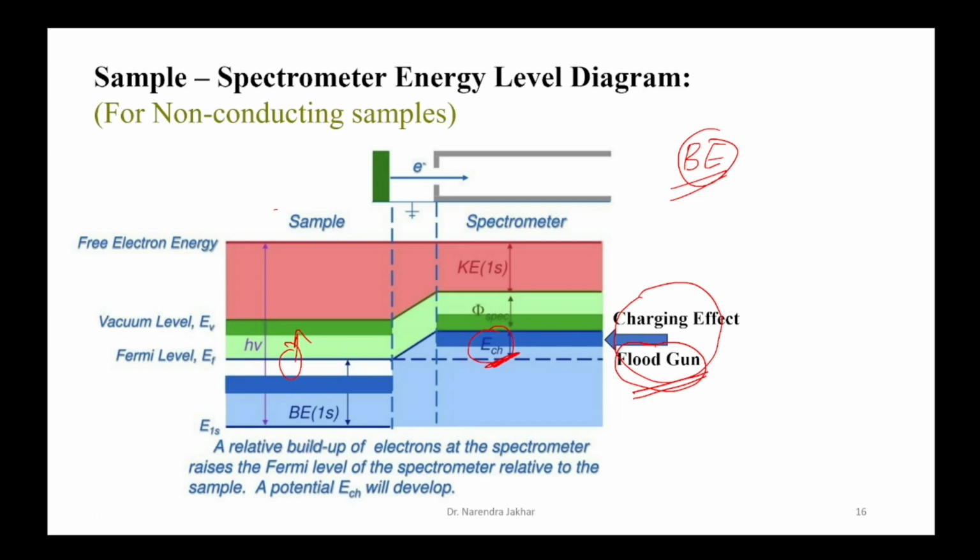So, till now we have discussed the different basic and working principles of the XPS.